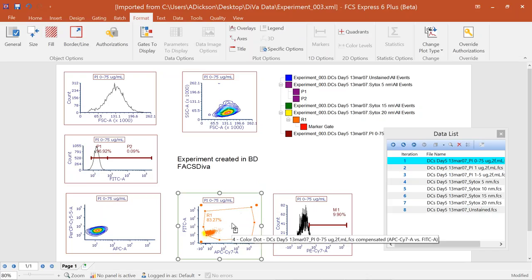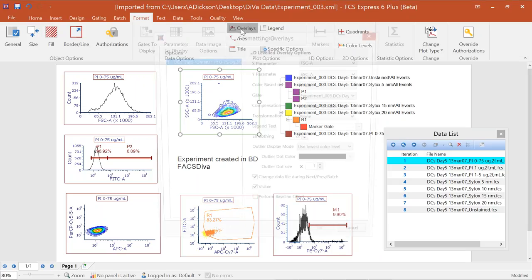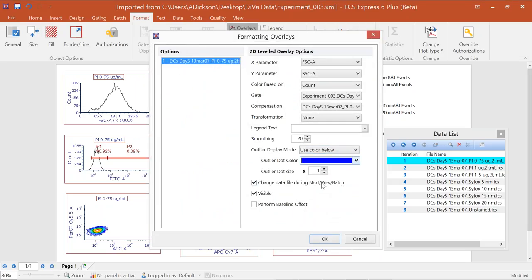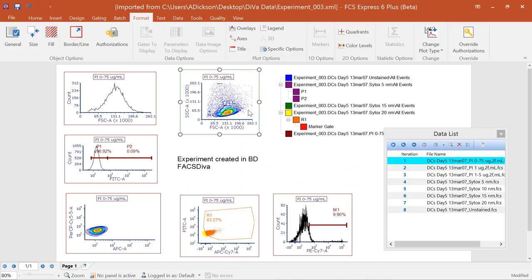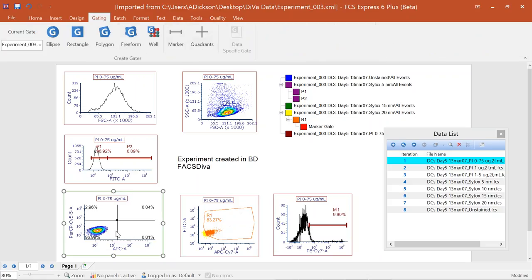In addition to formatting or converting imported plots, you can change how they're visualized. For example, contour plots imported from BD FACS DIVA don't include outliers by default. To add them, go into the Overlays option, choose to display outliers, and change their color and size. Now the outliers are visible on the contour plot.